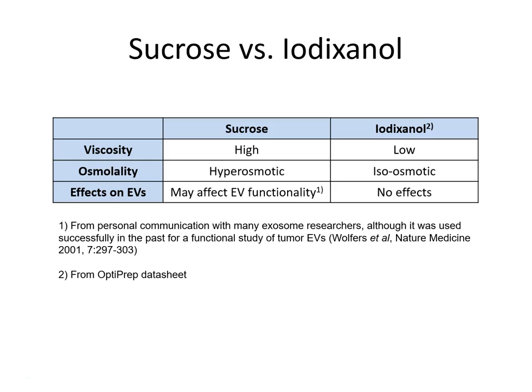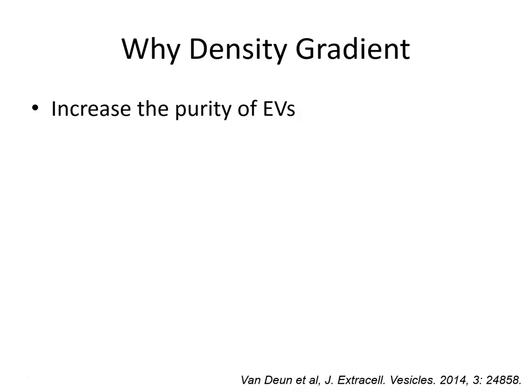In addition, the provider says that it is non-toxic to the cells, which may mean it is not toxic to EVs as well. So why is density gradient needed for EV isolation? The important thing is that density gradient can increase the purity of EVs.